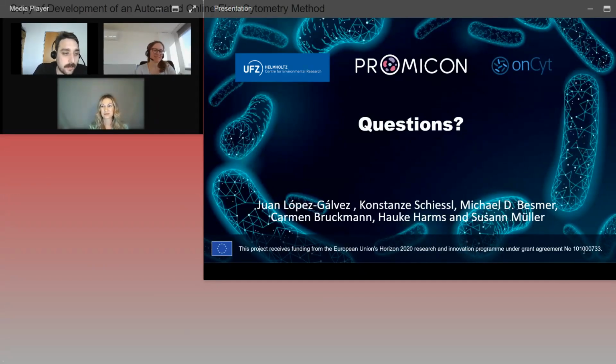We only chose 3 in these experiments because we are just validating a new procedure. But in our group, we had natural communities that have above 30 members. So it all comes down to the community you are measuring. There are some communities that will have members that are more similar to each other. This makes it more difficult to discern between one another. But we have had communities where we can identify above 50 different members.